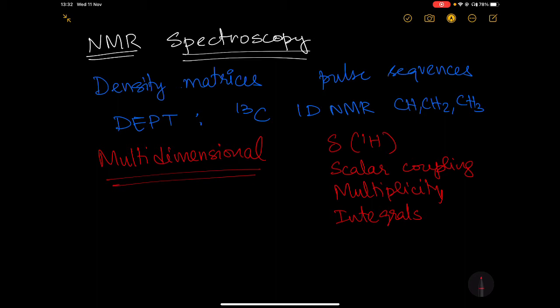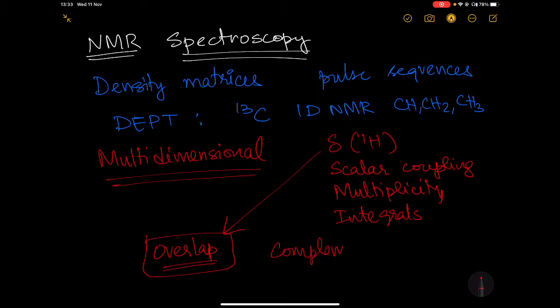However, you could end up in a case where the proton chemical shifts overlap due to several reasons. If you might recollect, what gives rise to chemical shifts is the electronic environment around a given spin. What could happen is that multiple effects could play a role such that proton resonance overlap might end up occurring. In order to still assign such protons at atomic resolution, you need other complementary information.